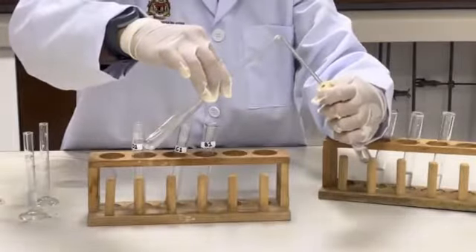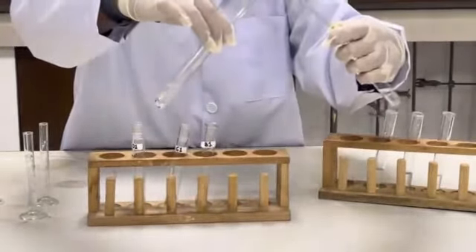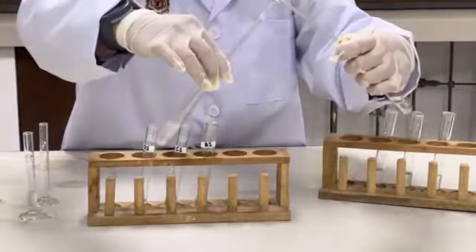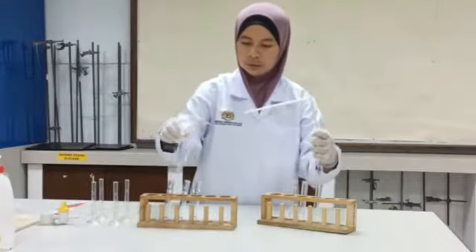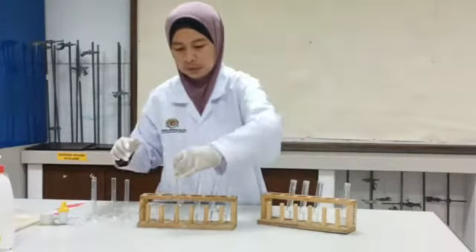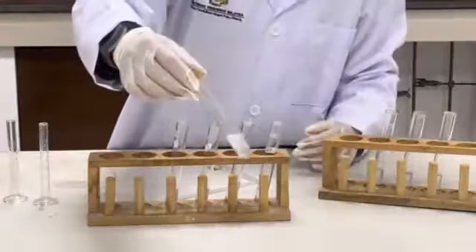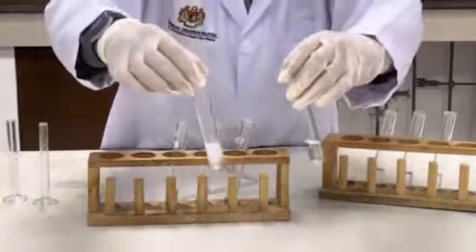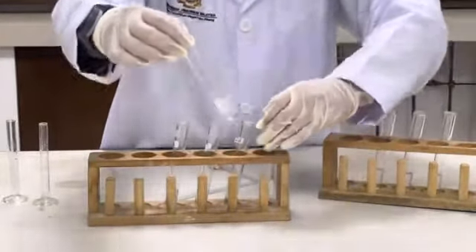The lime water will turn cloudy, as you can see for A1. We will repeat with B1, C1, and D1. On A1, effervescence occurs and the lime water turns cloudy.